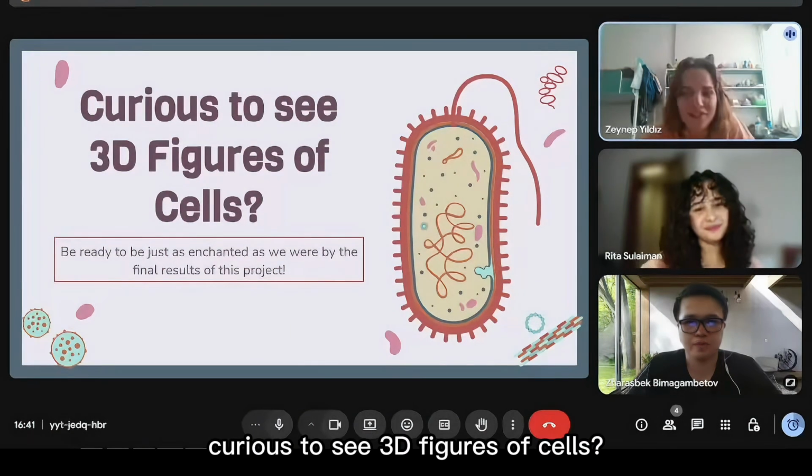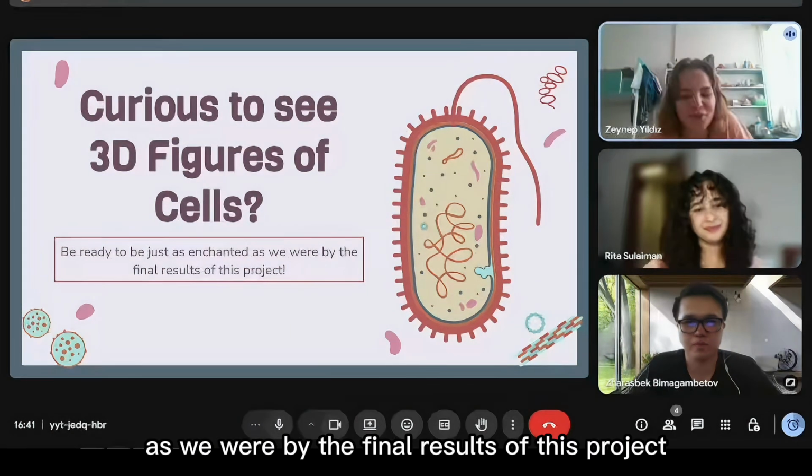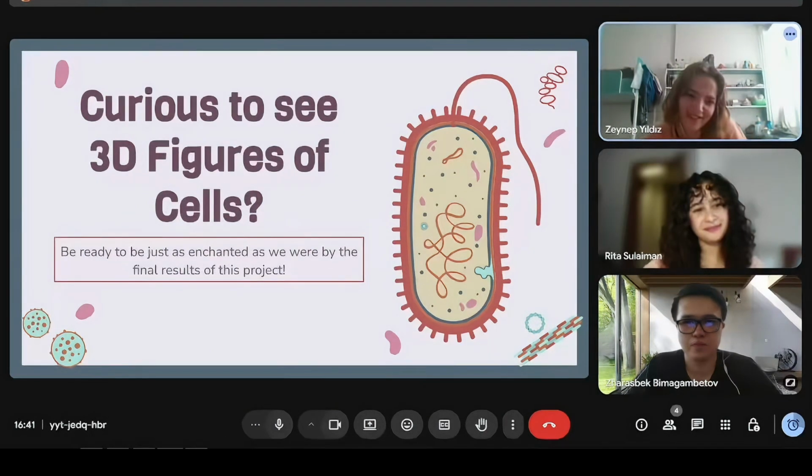Curious to see 3D figures of cells? Be ready to be just enchanted as we were by the final results of this project.